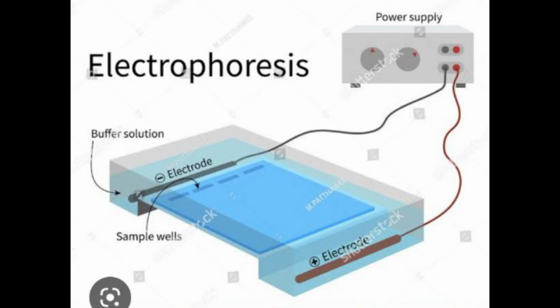SDS PAGE is usually the first choice as an assay of protein purity due to its reliability and ease. In the presence of SDS, the denaturing step causes the proteins to be separated approximately based on size, but aberrant migration of some proteins may occur. PAGE may be used as a preparative technique for purification of proteins.